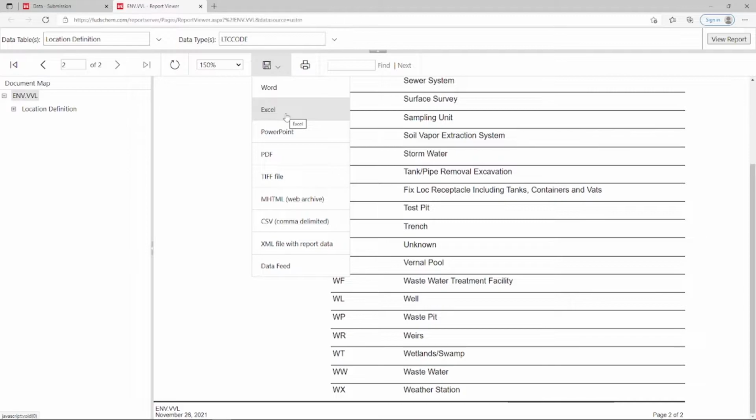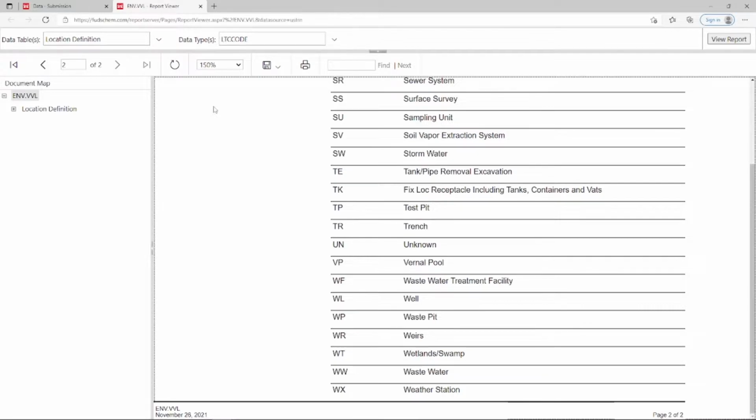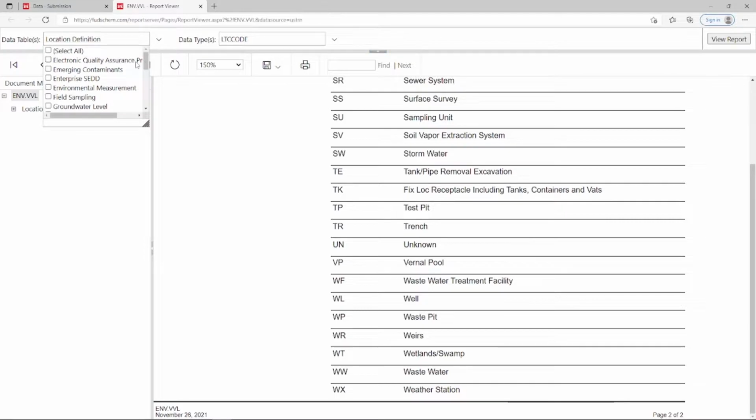The export can be used to populate flat files for data submission if the user prefers to submit a file rather than using the dropdowns in the interface. Valid values for analytes are also available in this report if you change the data table dropdown to a data type that reports analytes, such as SED 5.2.